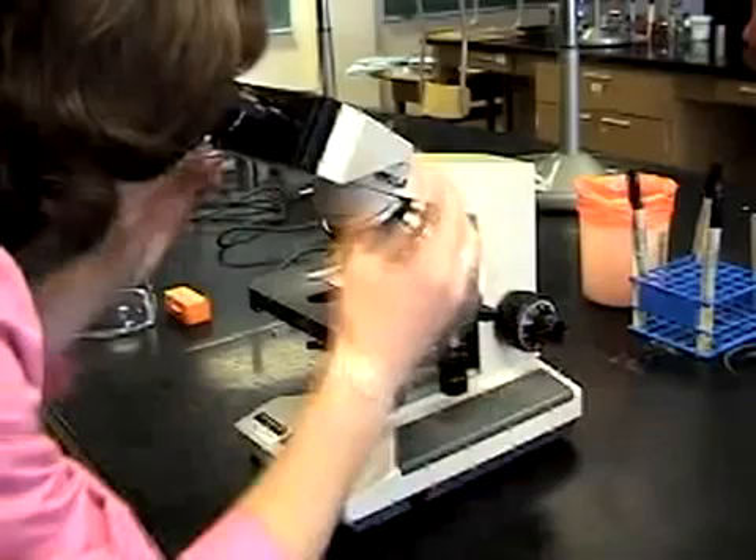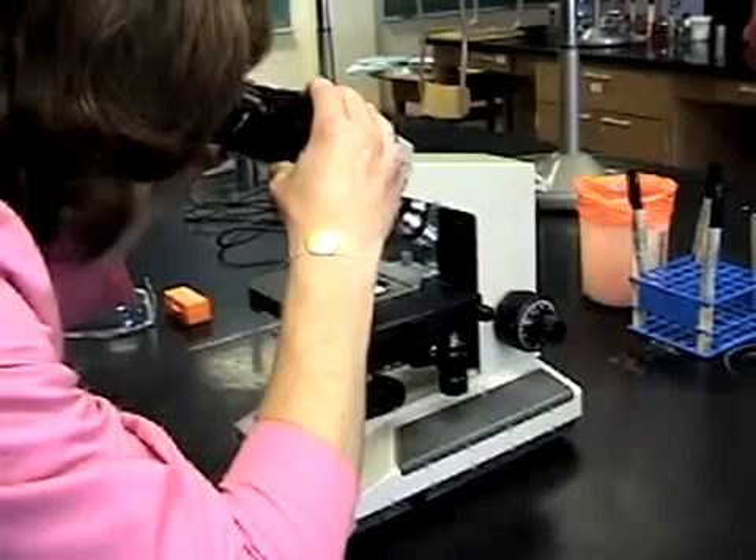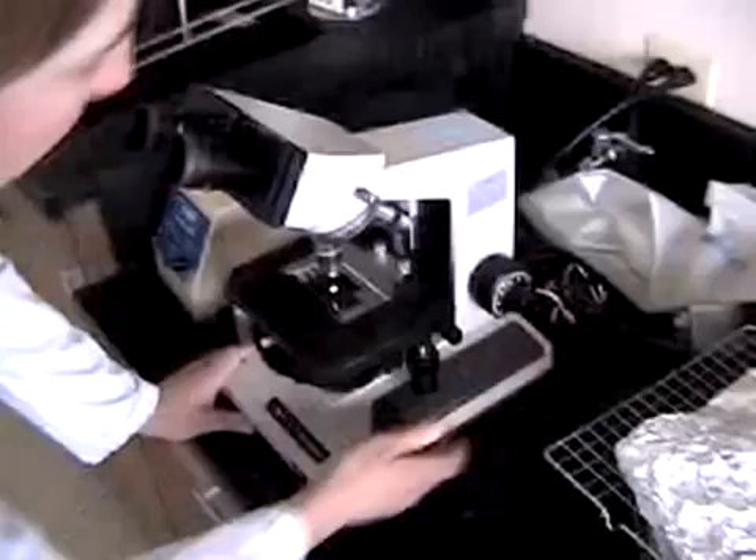You can move the stage around using your x and y-axis controllers to the right and below the stage. Now look through the ocular lenses and gradually pull towards you your fine focus knob until finally the focus line becomes clear.